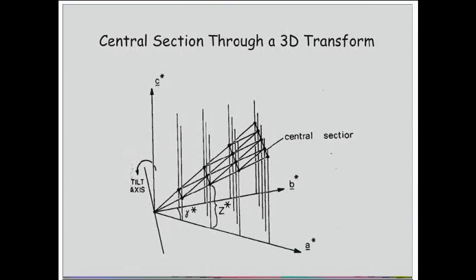So the problem that we've got is that we're trying to measure structure factors in 3 dimensions. You've probably seen this before: with these 2-dimensional crystals, in the 3rd dimension you have a set of continuous lattice lines, and the problem is how do you extract structure factors from these lattice lines and then turn those into a 3-dimensional structure.